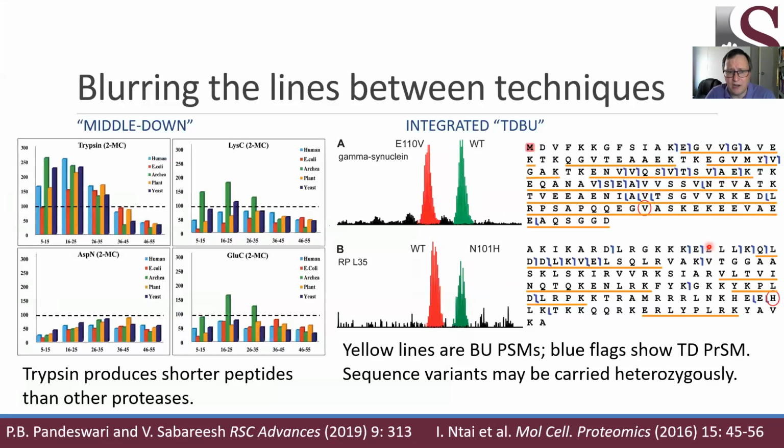Now, as we wrap down, I want to remind you that your choice is not always going to be top-down or bottom-up. You may have the option of combining them in integrated top-down, bottom-up, as I've shown over here at the right, or you might use a technique called middle-down. So let's start with integrated top-down and bottom-up.